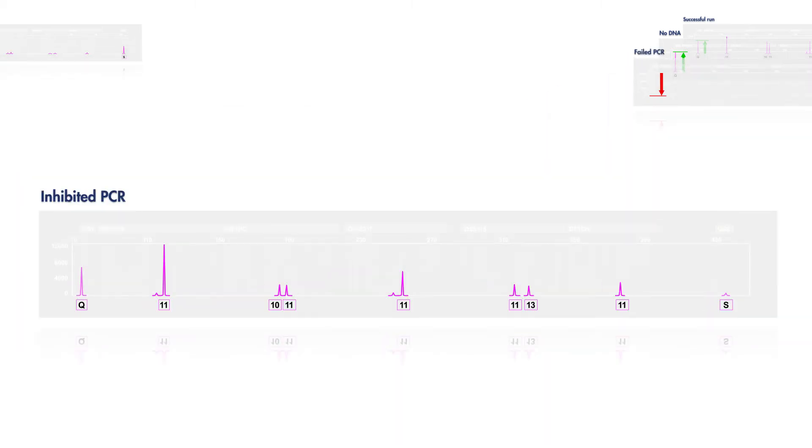Particularly high inhibitor levels can cause problems even for the robust investigator kits. In the past you couldn't tell inhibitor-laden samples from degraded DNA samples — now you can. Inhibitors have the same effect on quality sensor 2 as on larger STR markers, causing the ski slope effect. This, along with a small quality sensor 2 peak, means you might need to dilute the sample and reamplify it to get a non-inhibited STR profile.